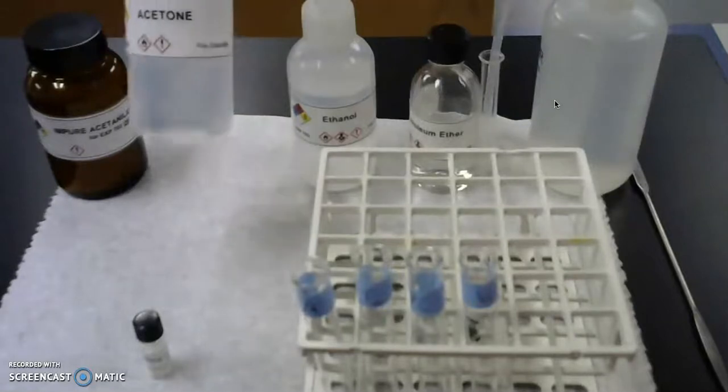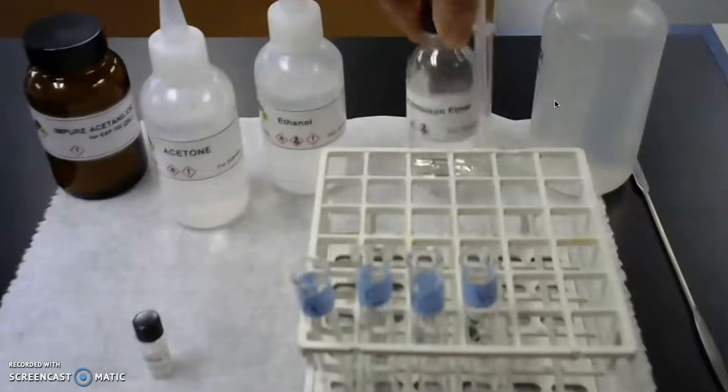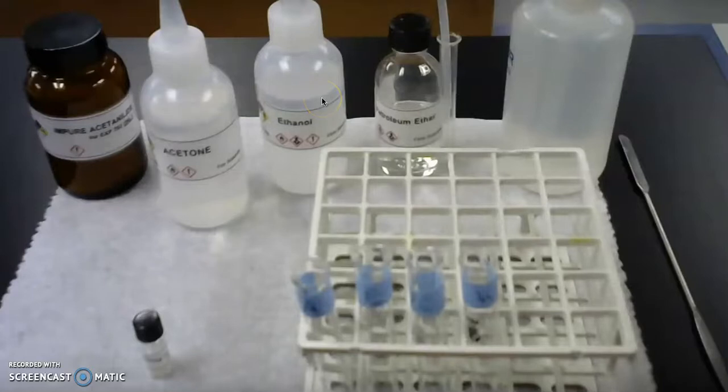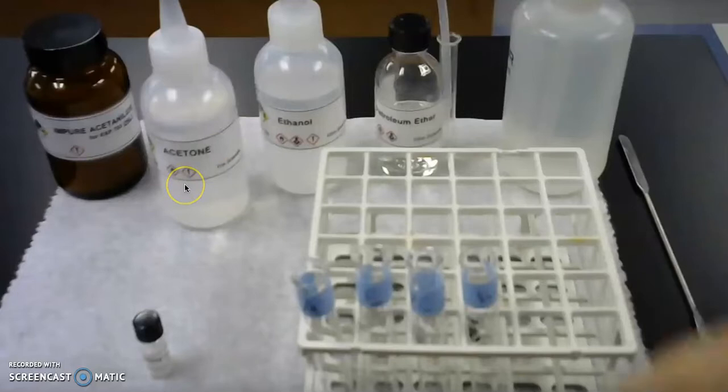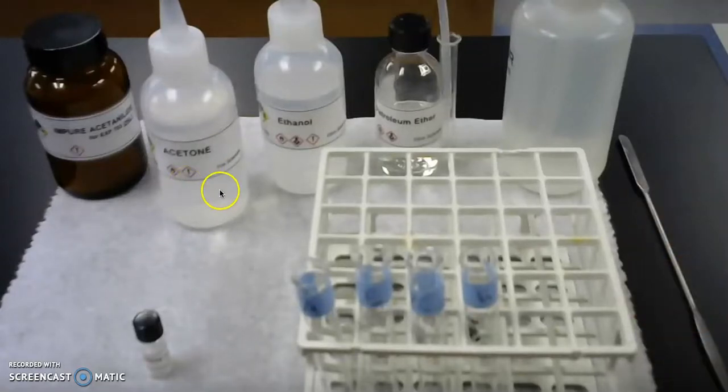We will start off by adding approximately one milliliter to each of the four test tubes. We'll measure the first one with a graduated cylinder and then we will add the rest based on an estimate off of the first tube.